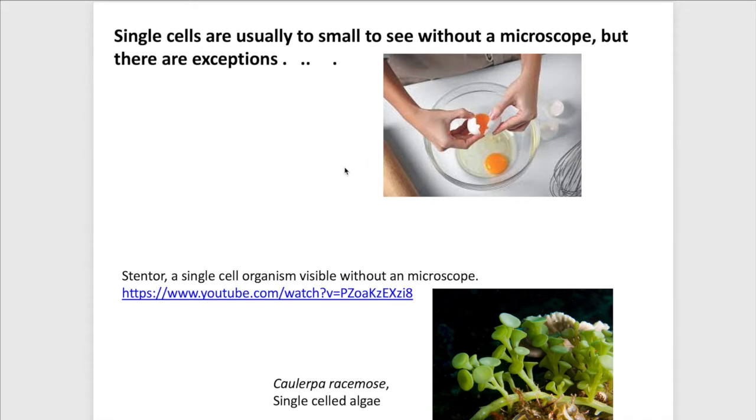And single cell here. Here's a kind of single-celled organism. So this is big enough that I can clearly see it. It's like a microorganism here. And this is going to be an organism that's called a stentor here. And so let's look at our stentor here.